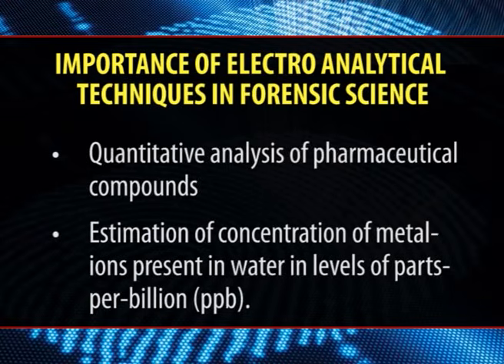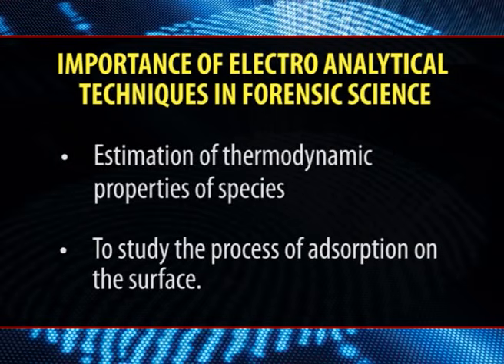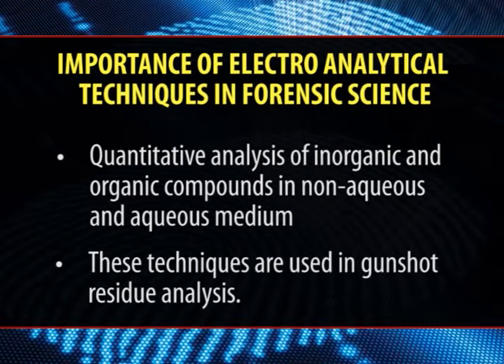Applications include quantitative analysis of pharmaceutical compounds, estimation of concentration of metal ions present in water at levels of parts per billion, determination of redox potential, estimation of analytes eluted in high performance liquid chromatography, estimation of the number of electrons in a redox reaction, estimation of thermodynamic properties of species, study of the process of adsorption on surfaces, and quantitative analysis of inorganic and organic compounds in non-aqueous and aqueous media.